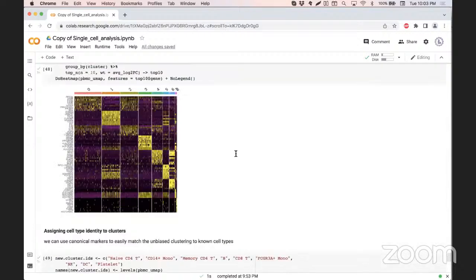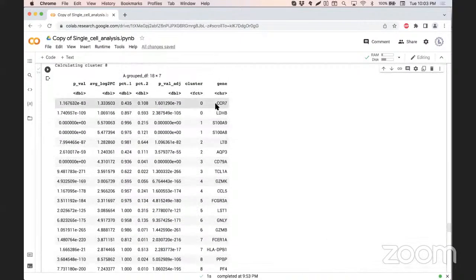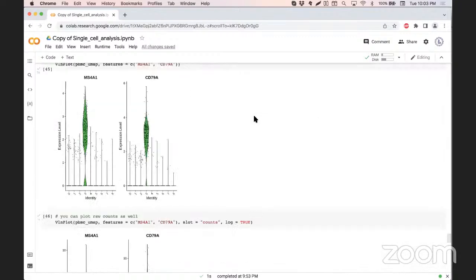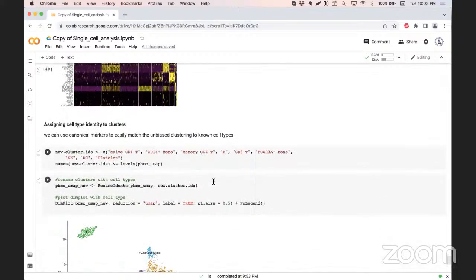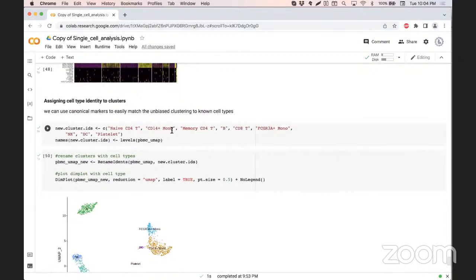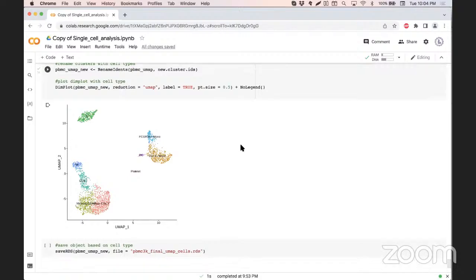So we have to take, for example, these marker genes and identify the cells that these marker genes are characteristic to, and then we can take those cell types and assign them to the cluster ID, and then we can use the new cluster IDs or the names of these identified cell types to visualize their presence or their segregation in the tSNE or UMAP visualization pattern.